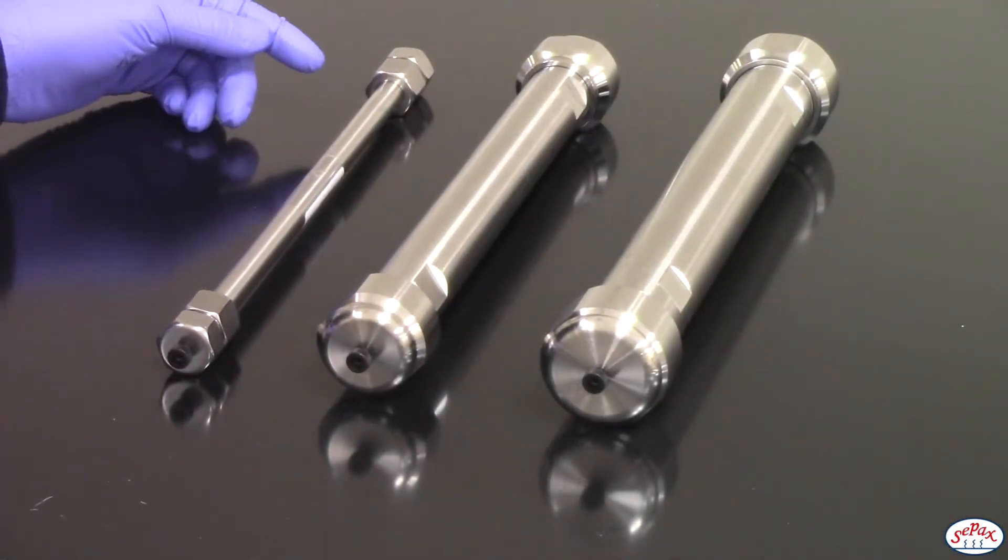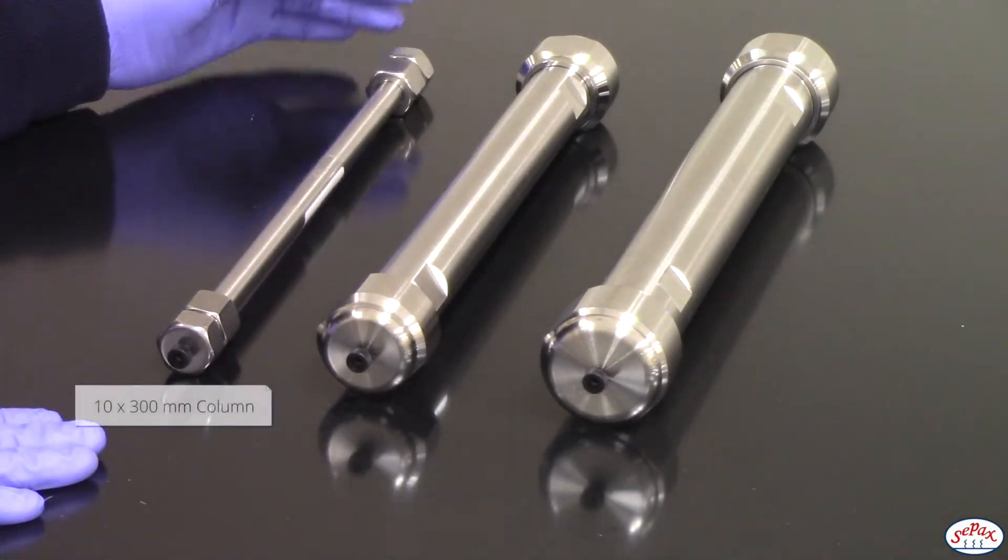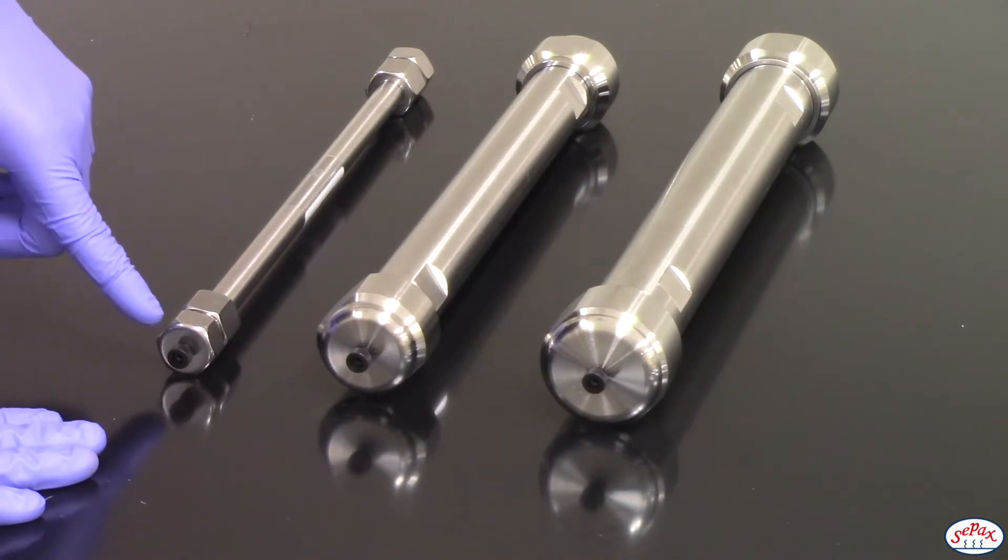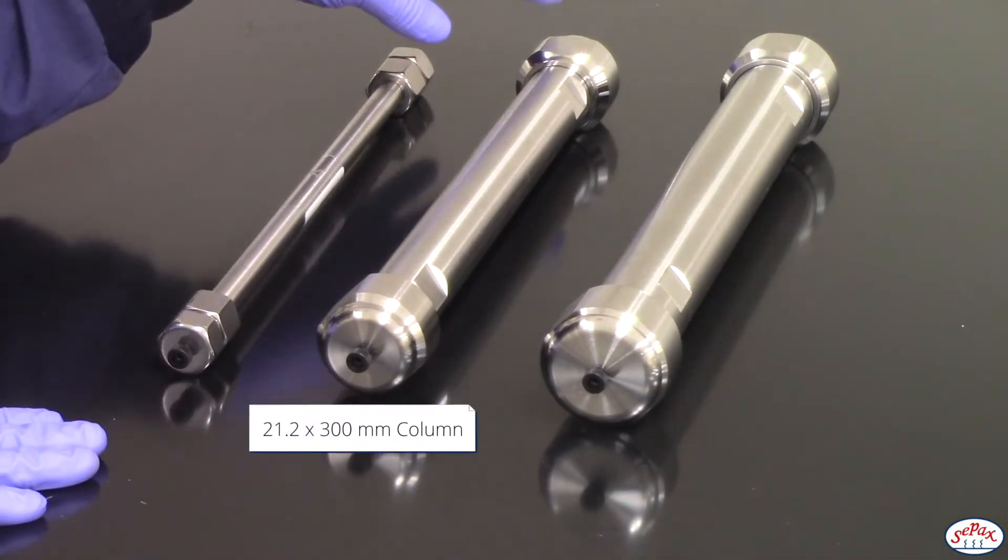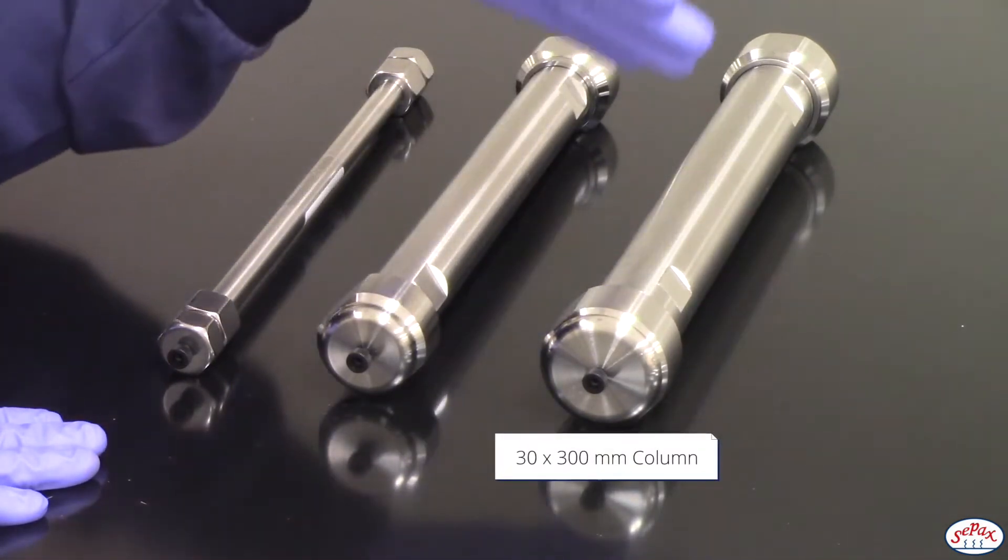Here we have several of the column dimensions that Setpacks offers. We have a 10 by 300 millimeter column, we offer 21.2 by 300 millimeter, and we also offer 30 by 300 millimeter.